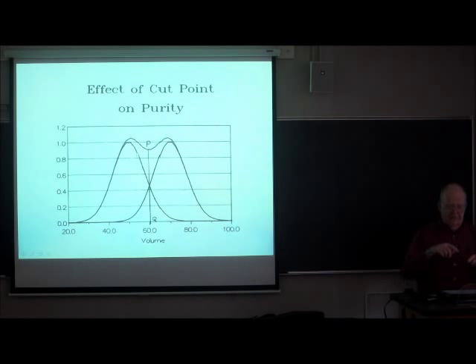What you see here is a split peak, and under the split peak, I'm plotting the two pure peaks that we add together to give the unresolved mixture. Clearly, the maxima are not matching. The maxima have moved towards one another. This is what always happens. Just think about it: you take two peaks and move them towards one another, the maxima have to move towards one another. They must. They have no choice but to do that.